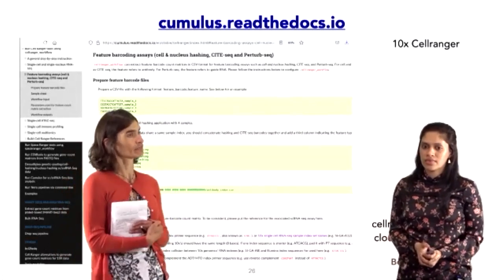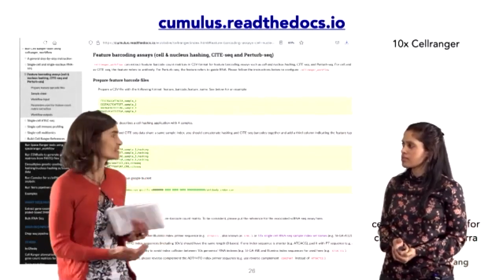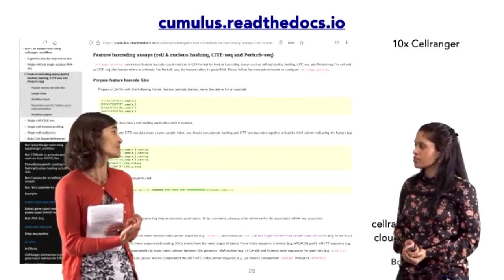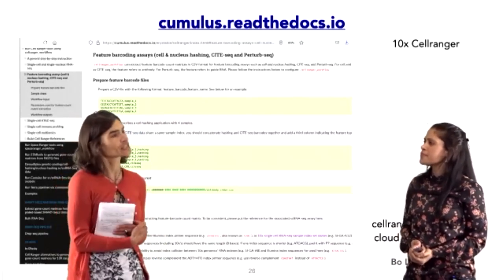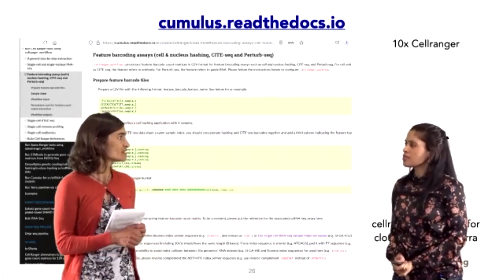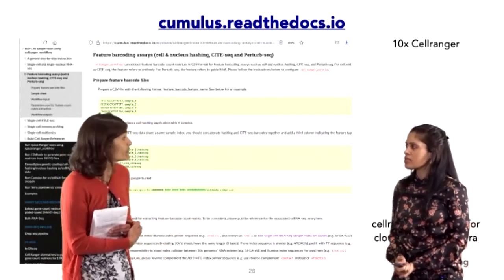And I can imagine, and there may be reasons that this is technically not possible, that if there's a bunch of instances where multiple guides go into the same cell, you might also be able to ask whether there are particular combinations of perturbations that are not consistent with cell viability. And I'm just curious about whether the system allows sufficient confidence in the independent entry of guides that you can see particular combinations that are diminished in their abundance such that you can make that type of inference.